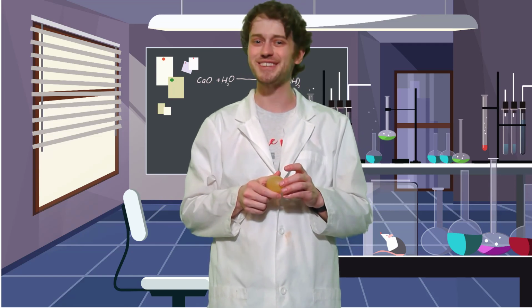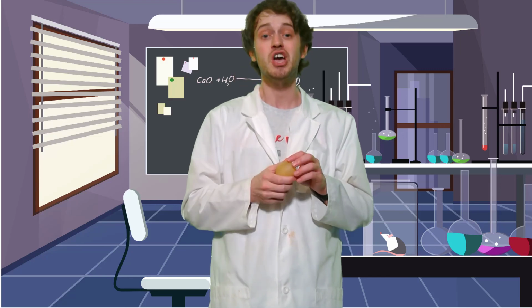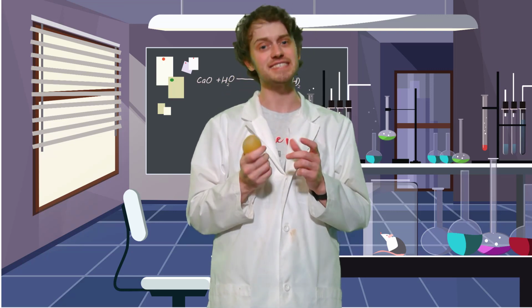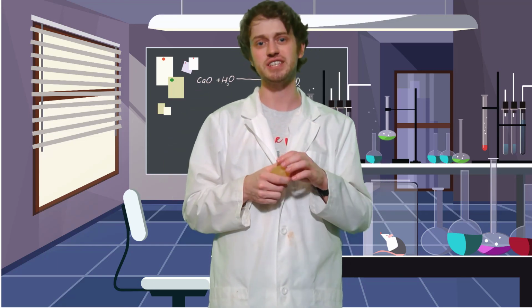All right, so the egg is out of the water. We have finished our last trial, so let's wrap this thing up. Egg is out of the water, and what was your prediction? What was going to happen to the mass and circumference? Guess what? It went up. So let's talk about the reason that it would have gone up. Since I put it in distilled water, we know the concentration of water is going to be much higher outside of the egg than inside of the egg. Since water flows from high concentration to low concentration, the water flowed into the egg, therefore increasing the mass and increasing the circumference.